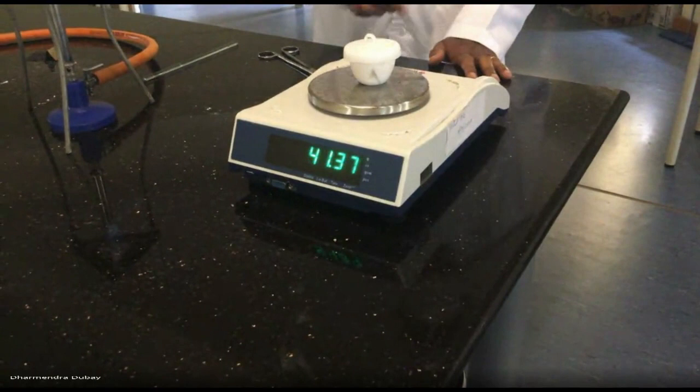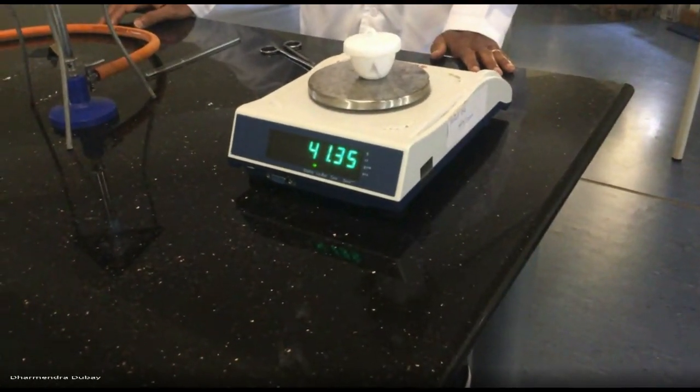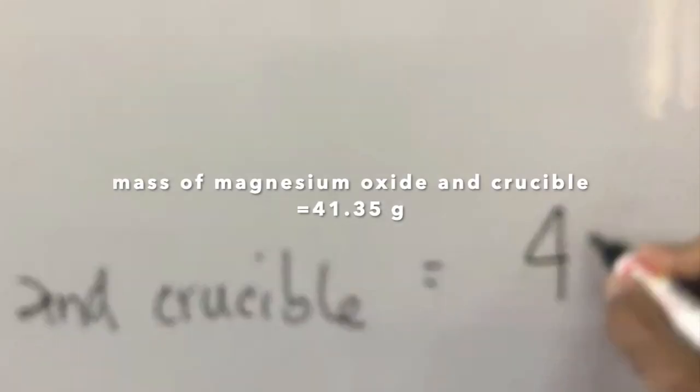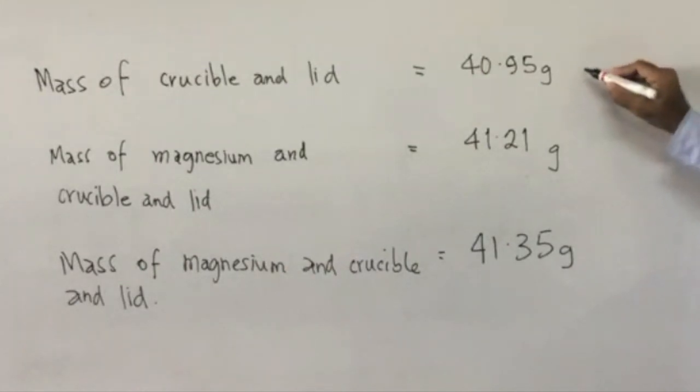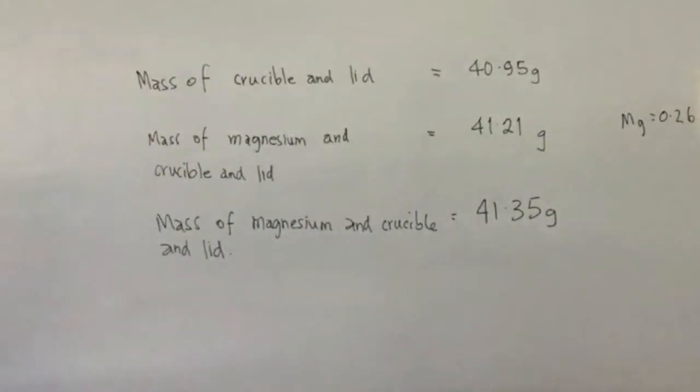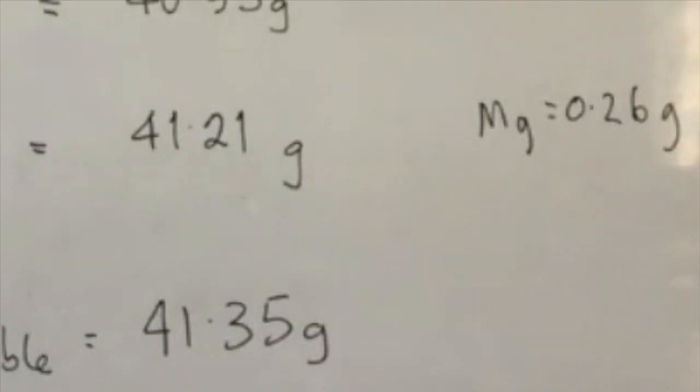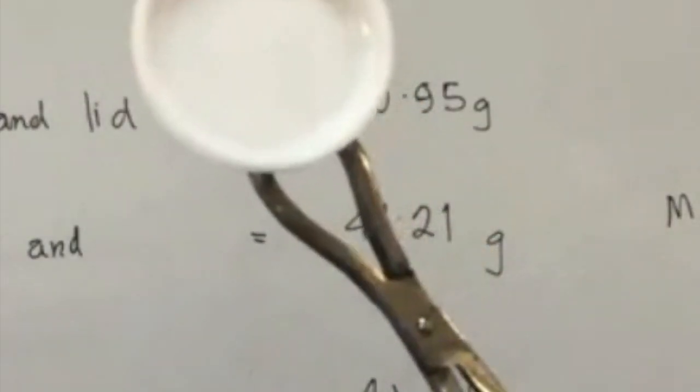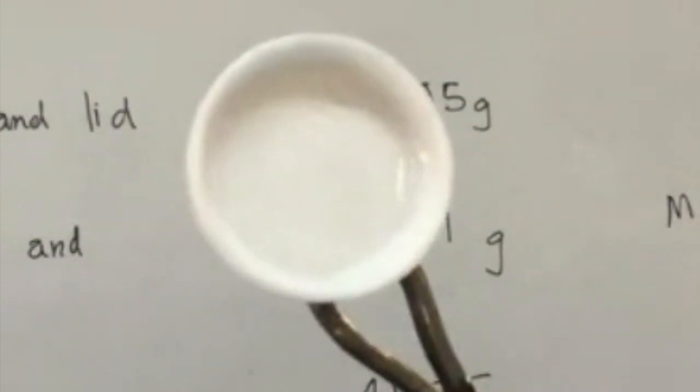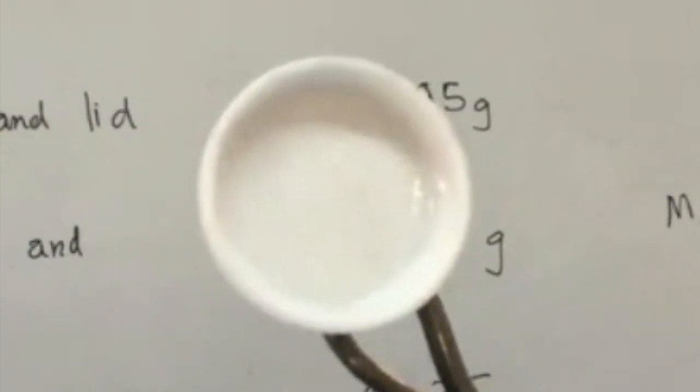All right, so we're getting 41.35. This difference here is the mass of magnesium used. So Mg that we use would be 0.26 grams. And then now after the oxygen is added to it, if anyone's had any doubt about whether this mass would go up, you see it's happened, it's gone up. Mr. Ranjan is bringing the crucible lid to show you. Yeah, the crucible lid has had a little bit of a coat of the oxide there as well. And that's interesting to know that.